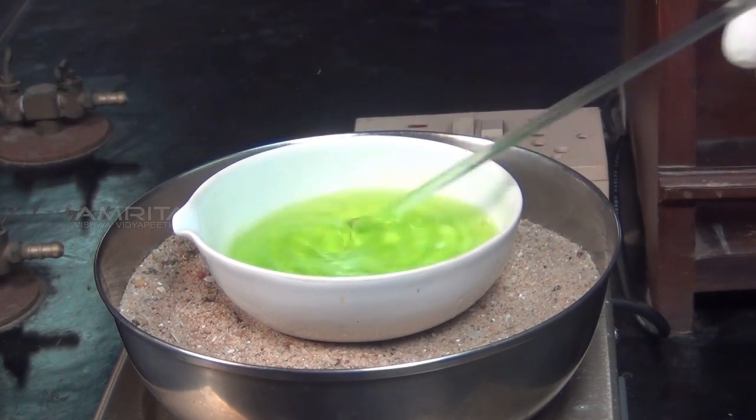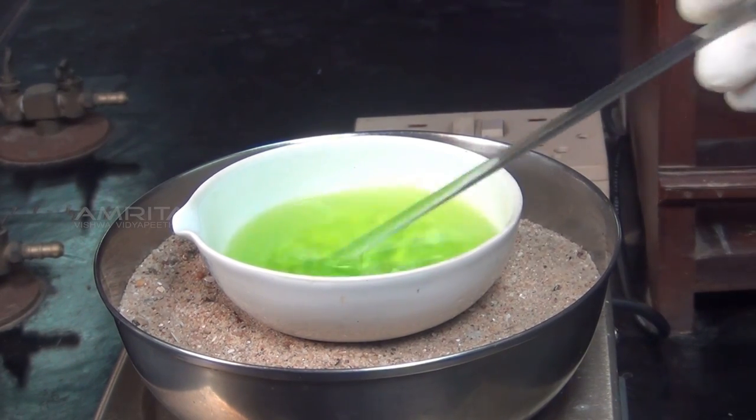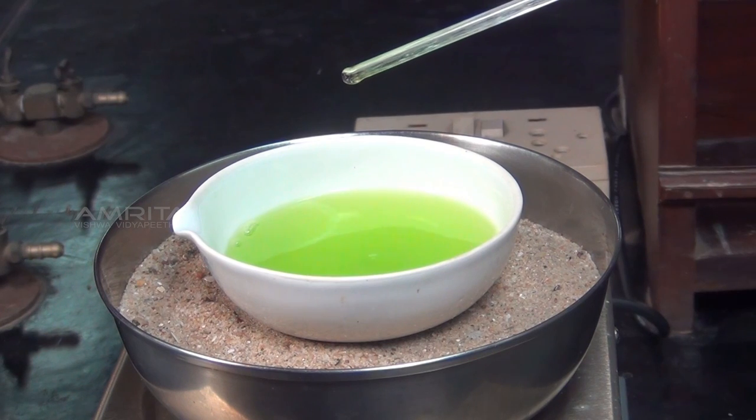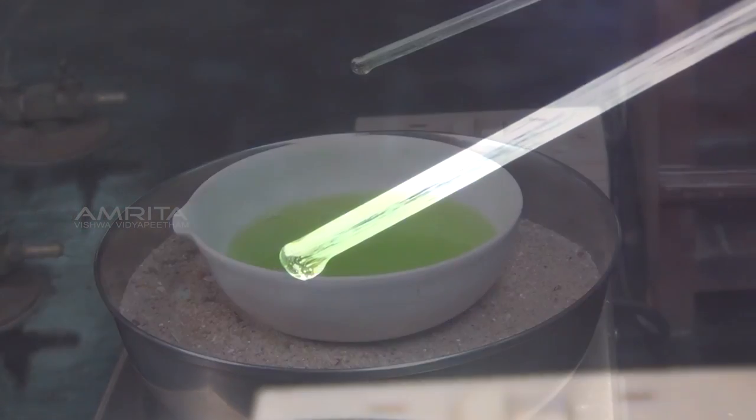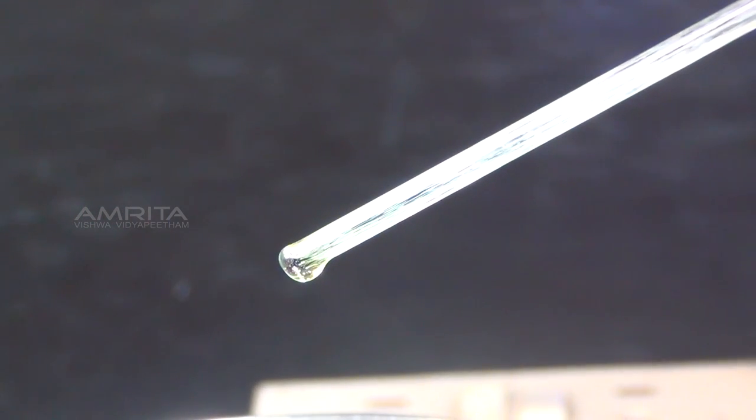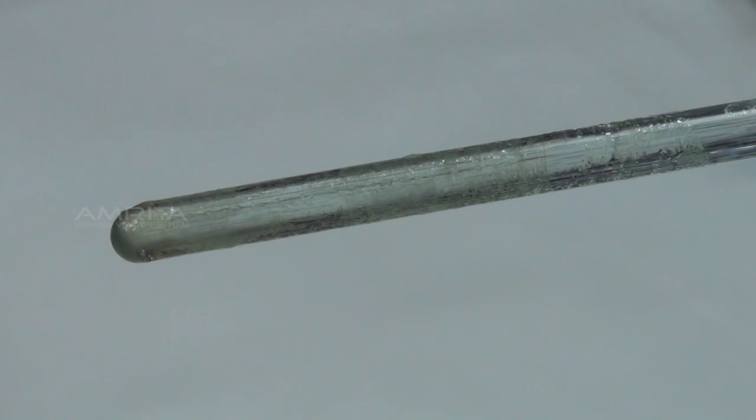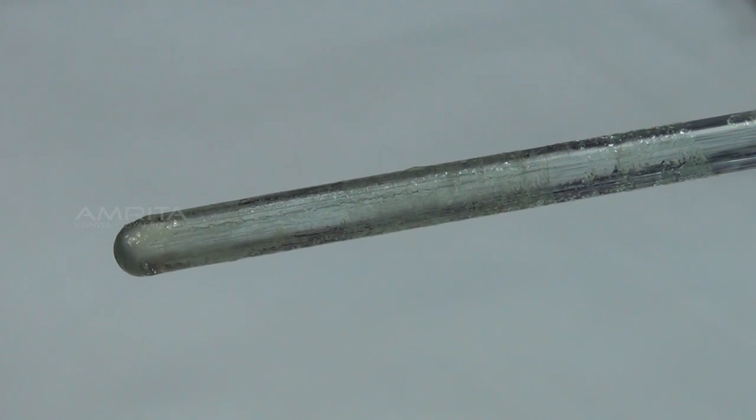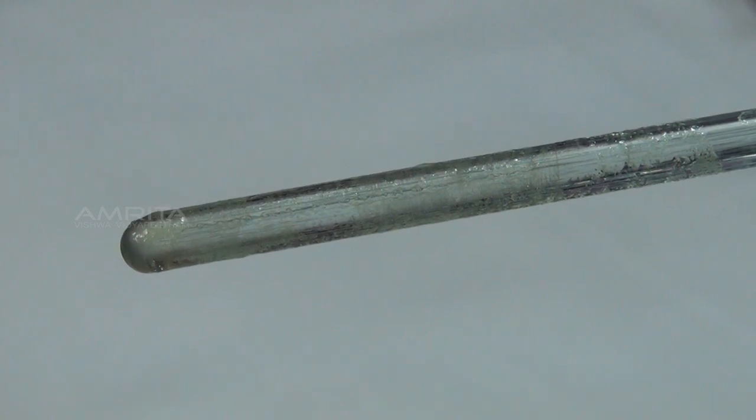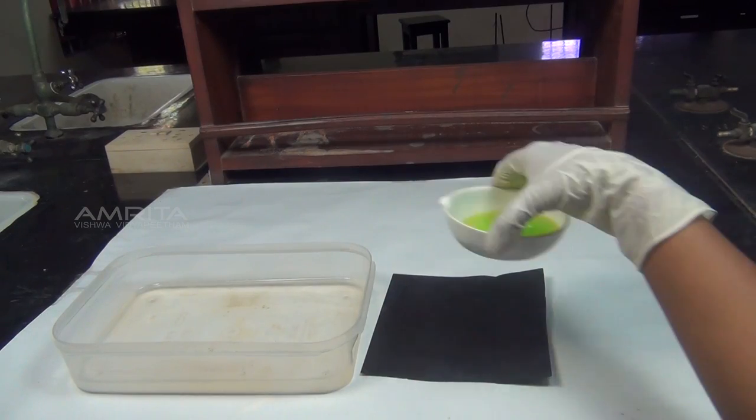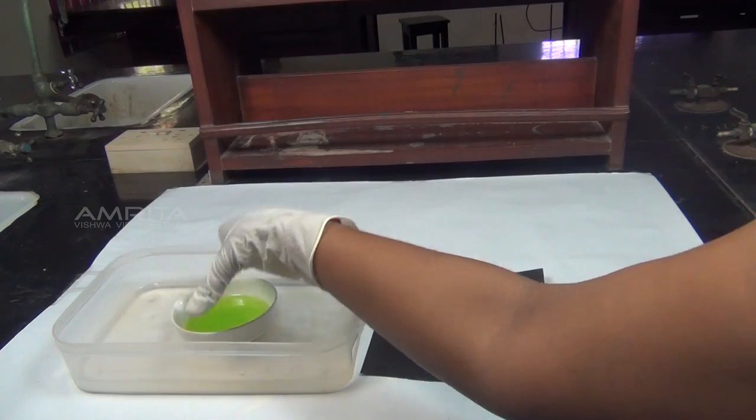When the volume of the solution is reduced to about one half of its original volume, take out a drop of the concentrated solution at the end of the glass rod and cool it by blowing. Formation of thin crust indicates that crystallization point has been reached. Now place the china dish in a trough containing cold water.